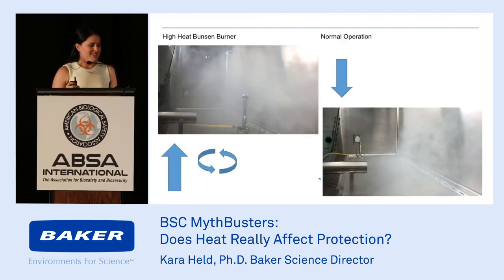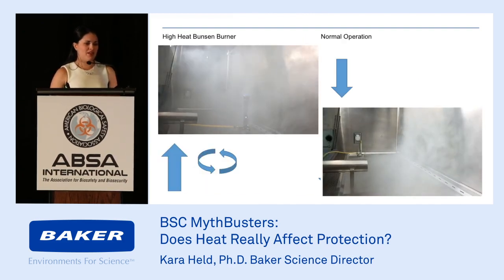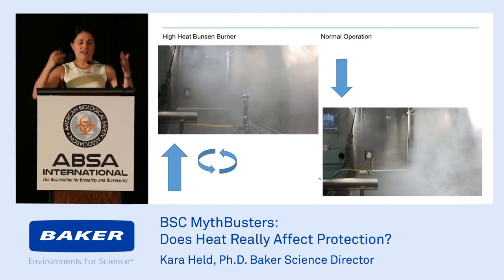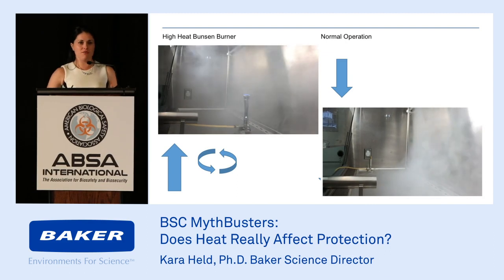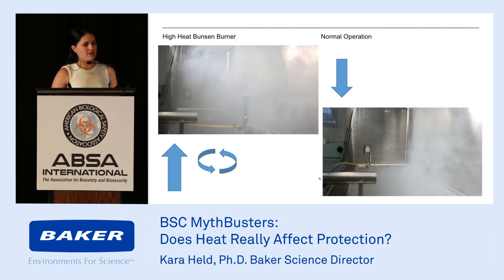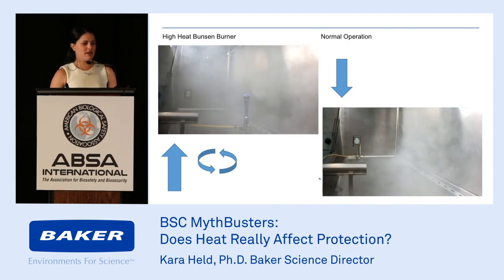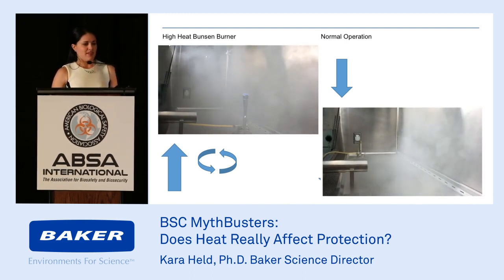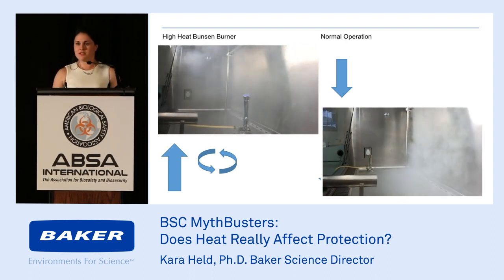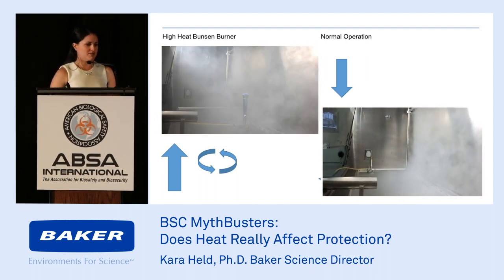Okay. So, we also did this with the other Bunsen burners. Shown on the bottom is what should normally occur, a nice smooth curtain from top to bottom flowing towards those front grates. And the high heat Bunsen burner looks like a hurricane in there. There's a whole lot of eddies going on where the air is swirling, and that leads to a huge source of contamination.